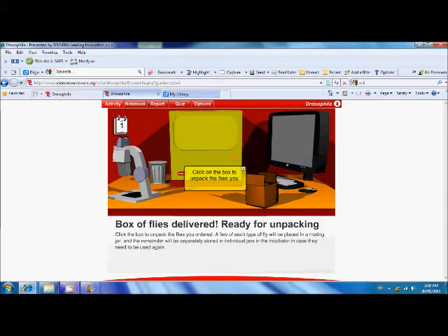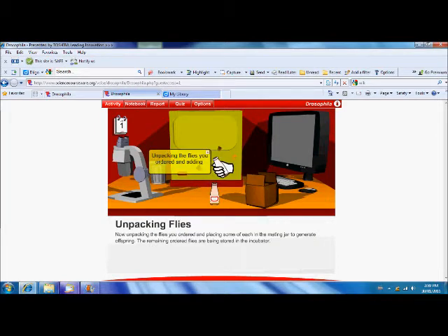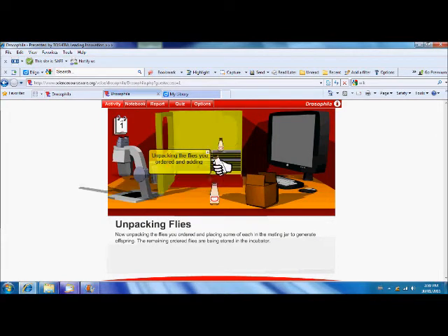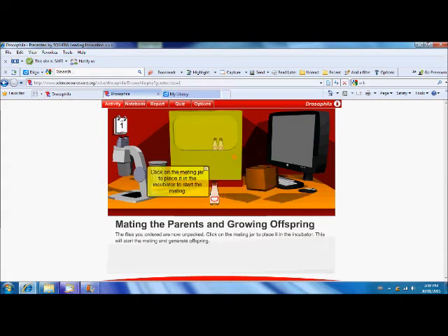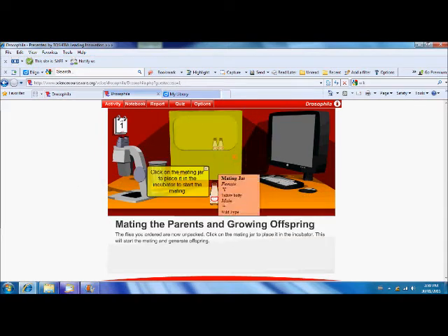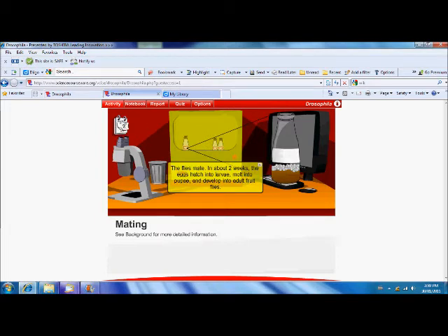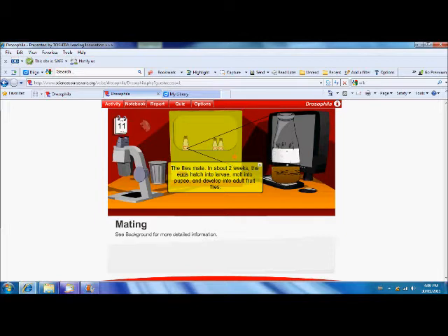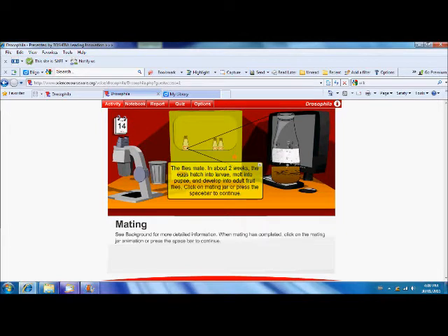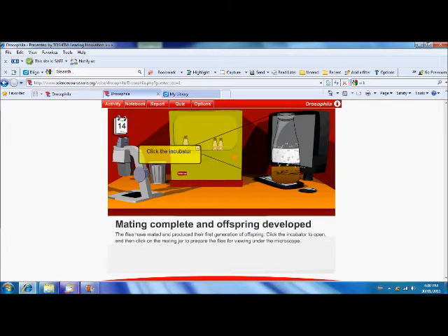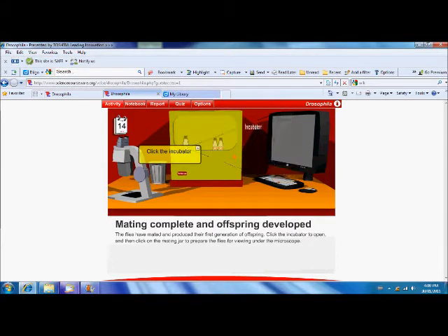It takes us back to the lab. So, we've now got our flies delivered. We'll unpack them and we'll put them in the incubator. Males and females. Okay, now we have to click on our jar to start them mating. See the eggs are turning into larvae and our flies have hatched. So, let's click here to see what we have.